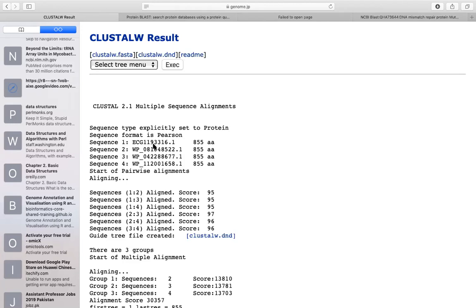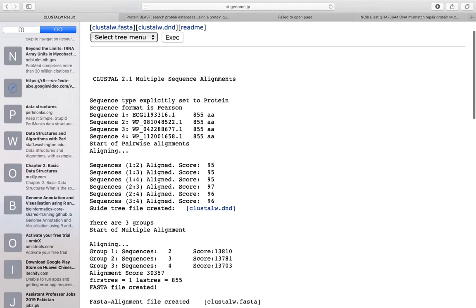Each gene or each protein has a different length — the length varies. I used MUTS gene here because it codes proteins. You can take any other protein-coding genes, and you can also take 16S and 18S as well as non-coding genes for multiple alignment.